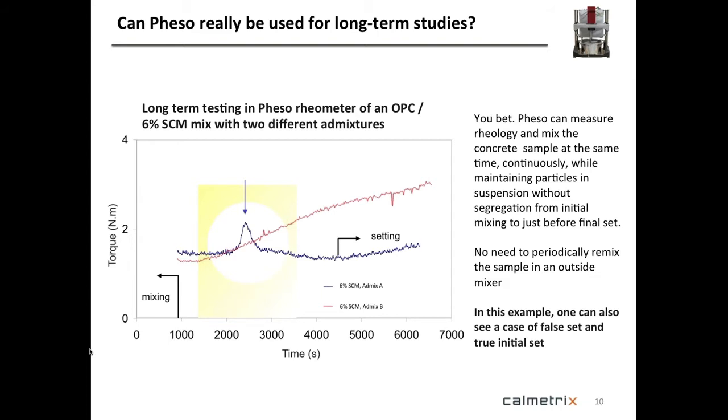And as you see, if you look at especially the blue curve, you can see that at some point we reached the setting time. You could actually see the setting time on this particular curve for this mixture. So you see the initial set. Of course, after a while you have to stop, because if you get to final set, then everything sets and it gets rock hard. It gets very difficult to get your impeller out and to save your vessel. So you see the initial set here on this blue curve.